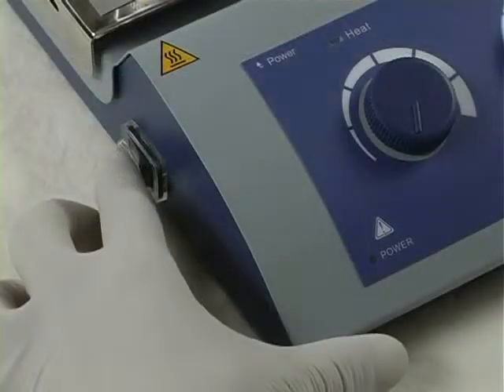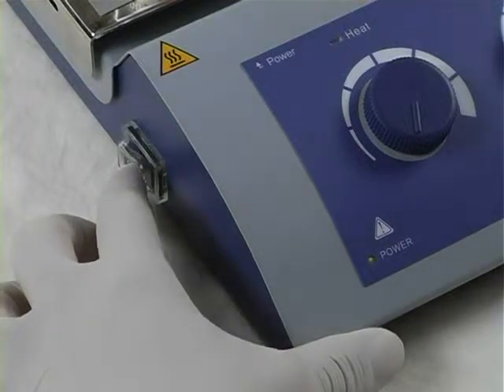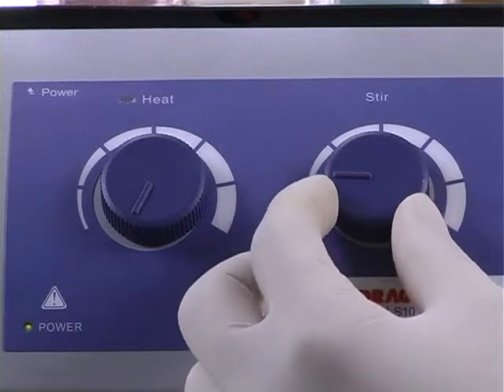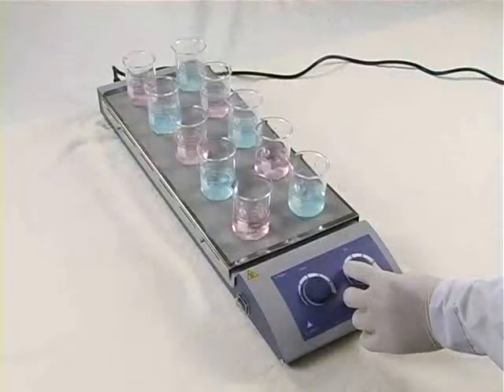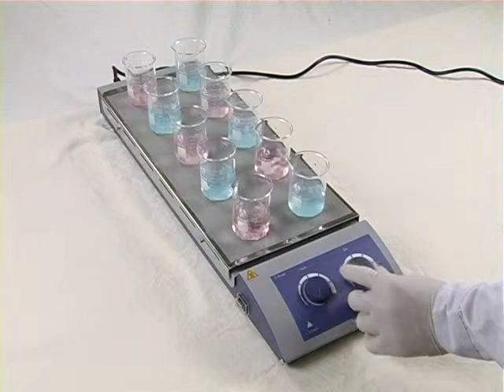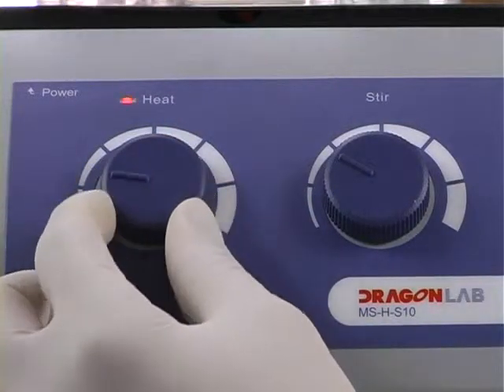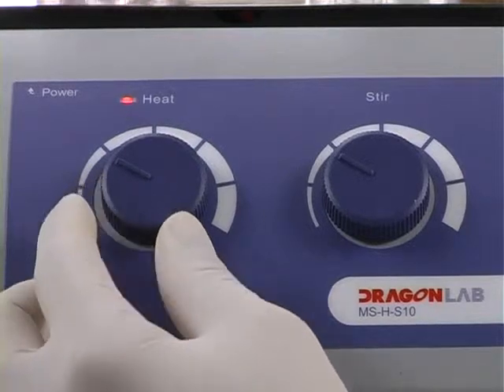Turn on the device. The power LED light will illuminate. Turn the speed control knob slowly to the ideal scale. Turn the temperature control knob slowly to the ideal scale. The heat LED light will illuminate.